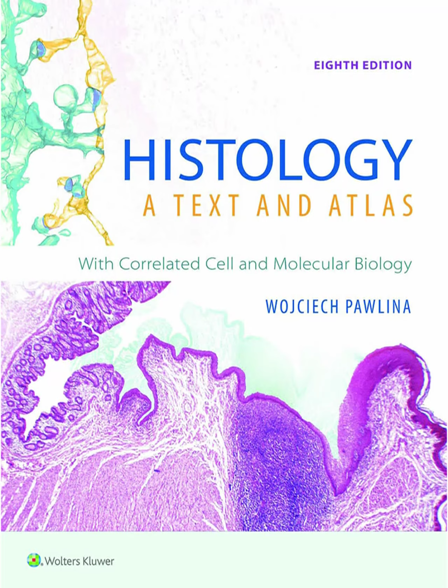Think about it. Your naked eye can distinguish objects that are about 0.2 millimeters apart. Maybe a bit better for some people. A good bright field light microscope, however, can resolve down to about 0.2 micrometers. Micrometers again. That's a 1,000-fold improvement. It's the difference between seeing a blurry dot and seeing individual cells or even large organelles inside them. The objective lens is what determines this resolution primarily. The ocular lens just magnifies the resolved image. 1,000 times better. Got it.